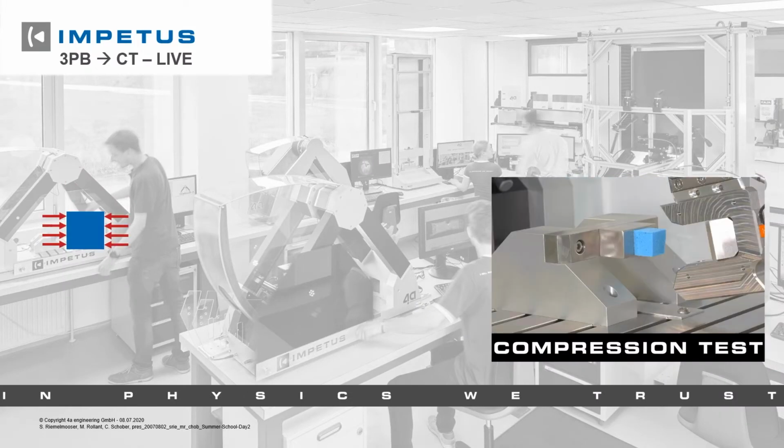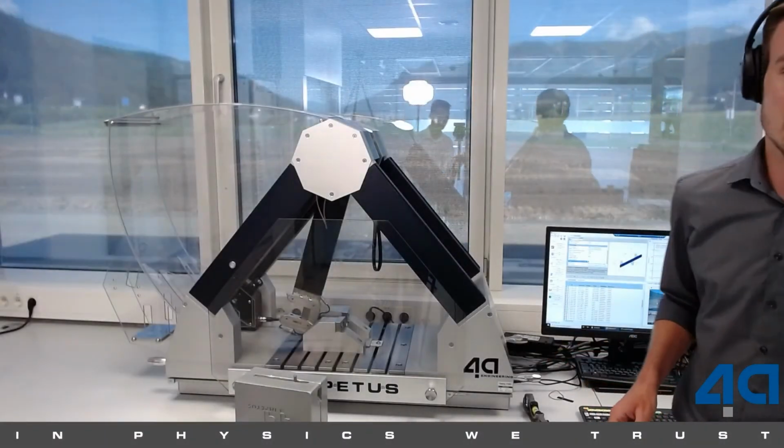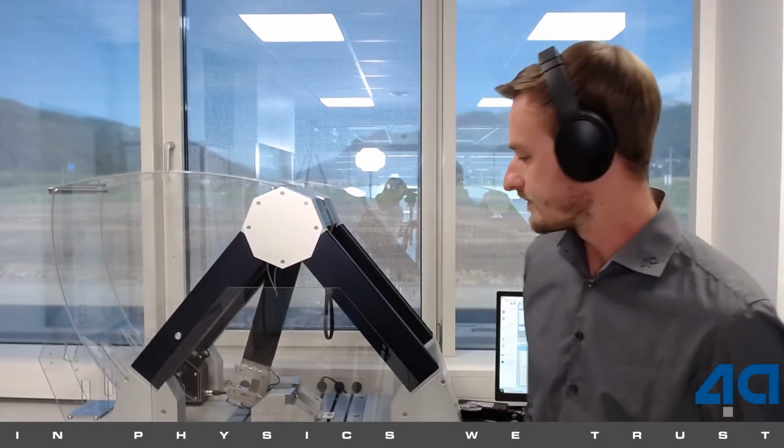Okay, as you can see here, now we will change the 3-point bending setup to a compression setup to perform a compression test on a foam, and you will see how fast it will go.